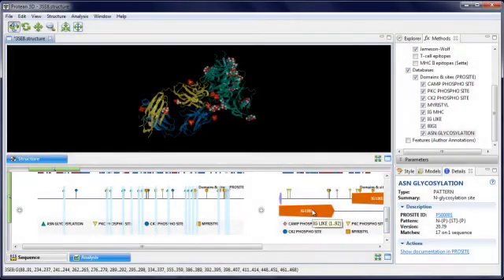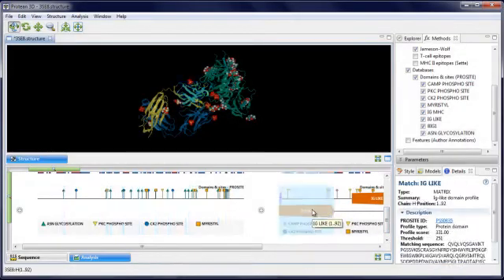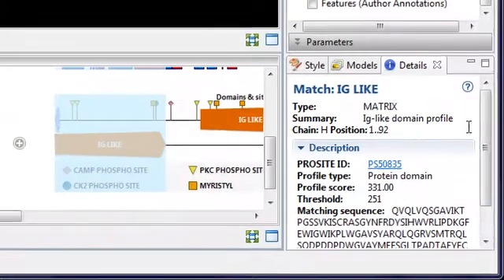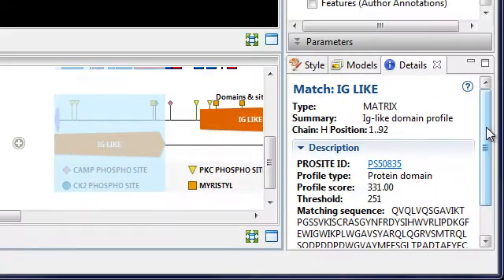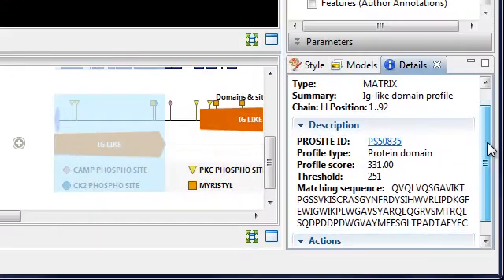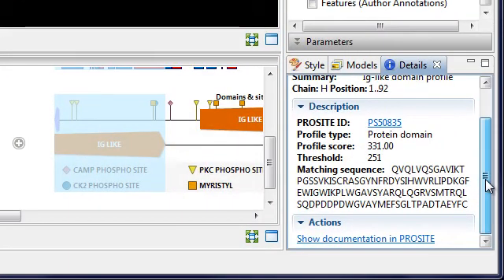Also notice that with each selection, information about the pattern match is shown in the details panel.